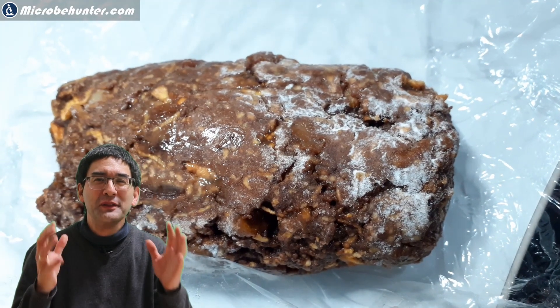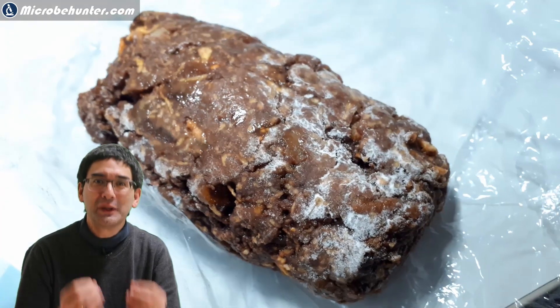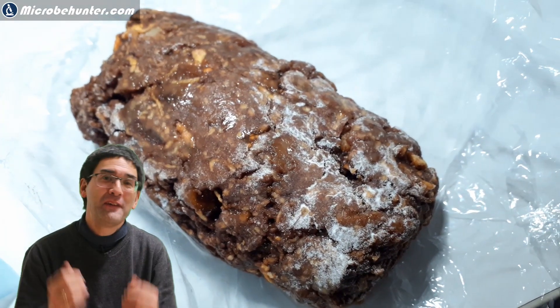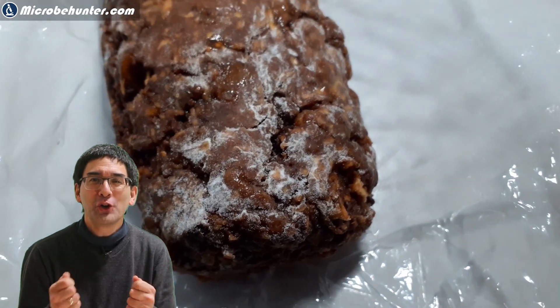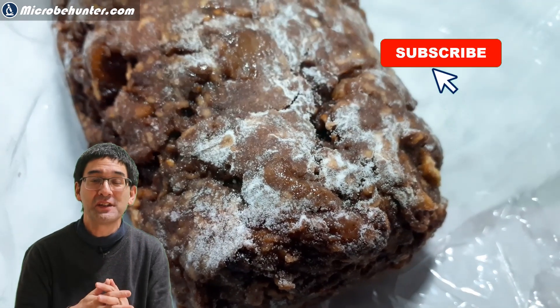Hi, Microbe Hunter here. You will never guess what this is — this is so-called fruit bread. It contains dried fruits and nuts and it's one of my favorites. When I first saw this bread I was a little bit concerned because there is some strange white stuff on its surface, as you can see here.